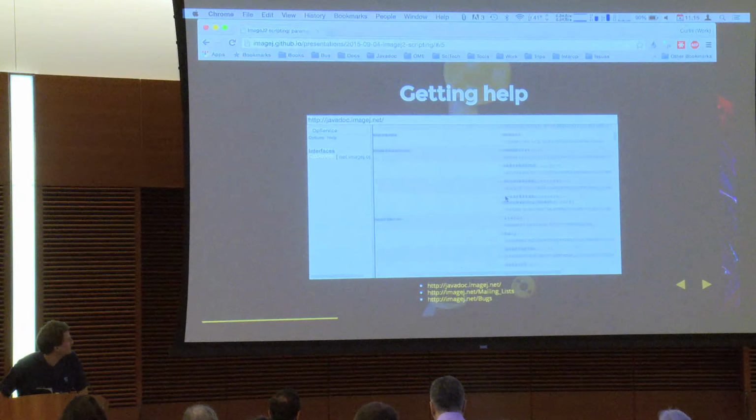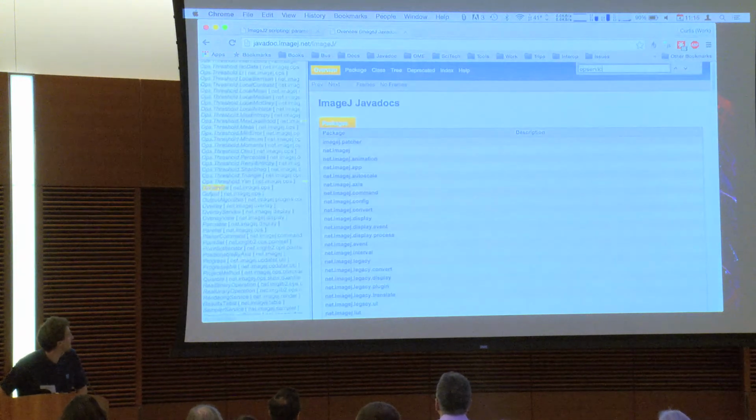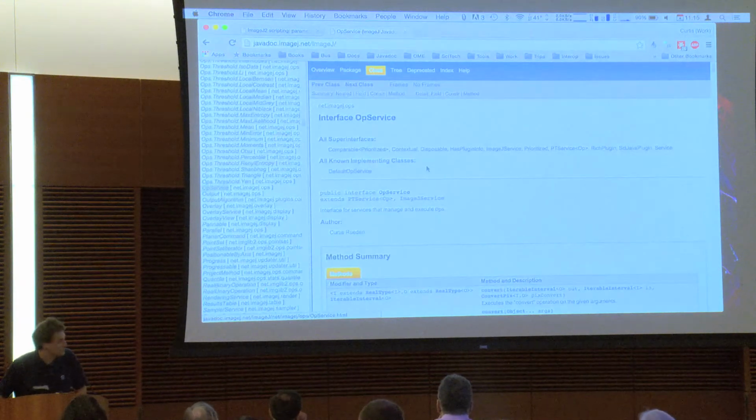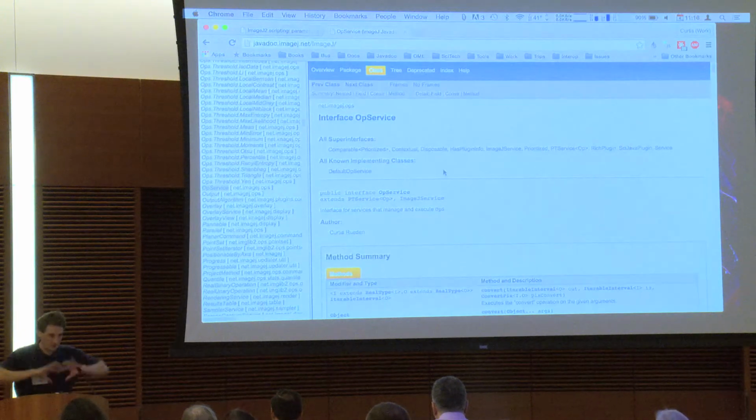This is unfortunately too small, so maybe I should just use my real web browser. Everything's divided into what we call namespaces, which is a really common term. Namespaces are like packages in Java or similar things in pretty much every language, just to categorize things. We started out with only global. All ops needed to have one name, so there was add. And we decided that was probably a bad idea when we ran into things like bitwise and versus Boolean and. There are definitely cases where you want to separate and classify.